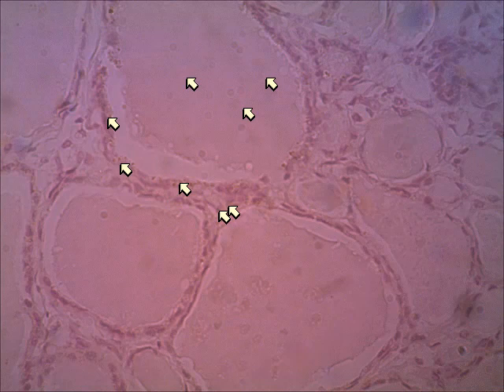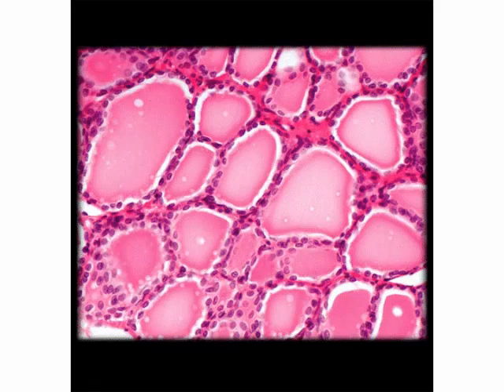Don't worry about that for lab. That's lecture material. Just be able to identify that this is a thyroid gland, and what you see there are thyroid follicles. This next slide is also the thyroid gland, and the follicles should be very obvious to you on this slide. It's pretty much everything you see is a thyroid follicle.